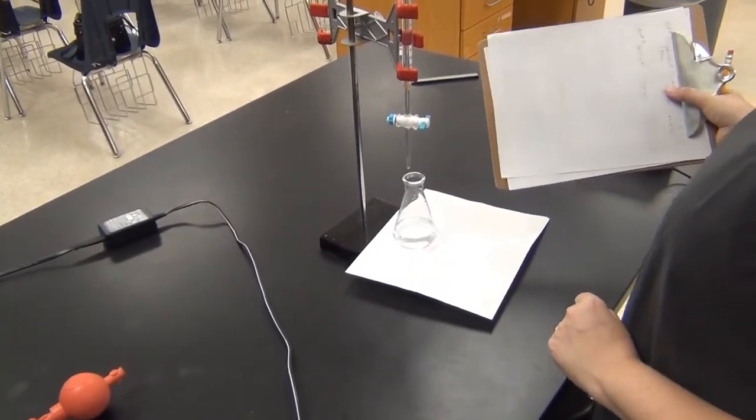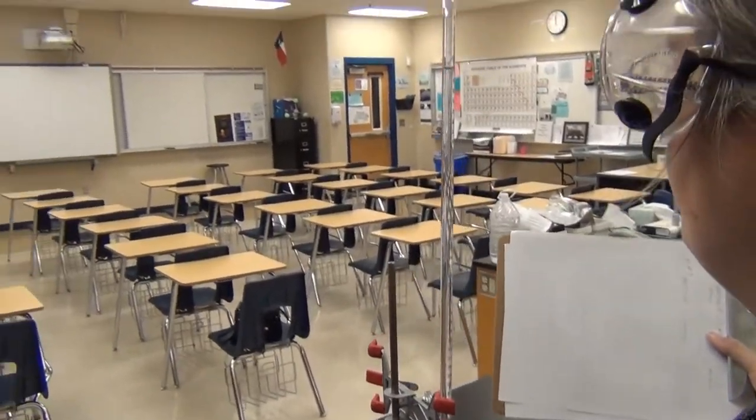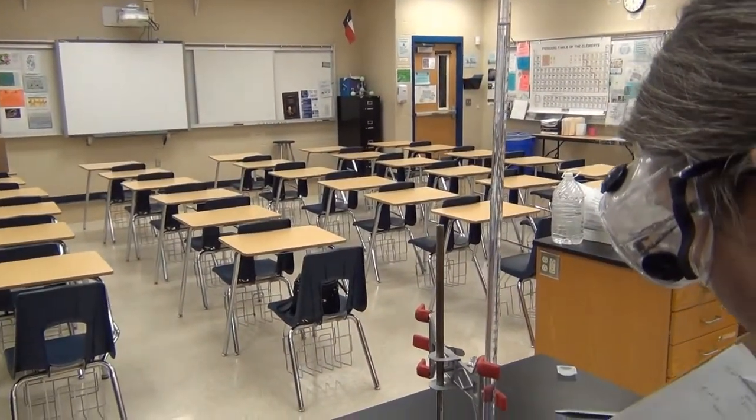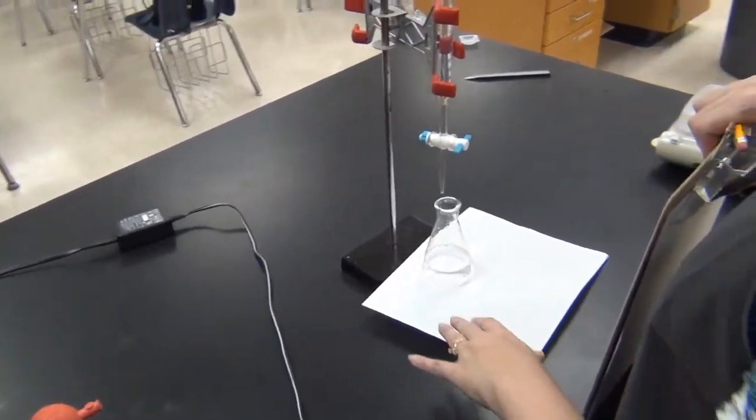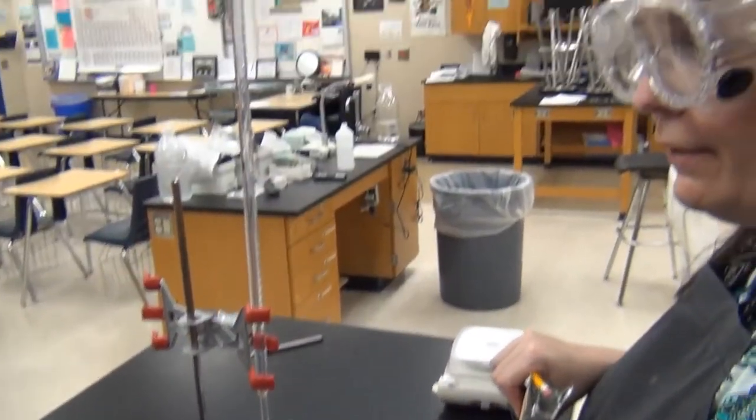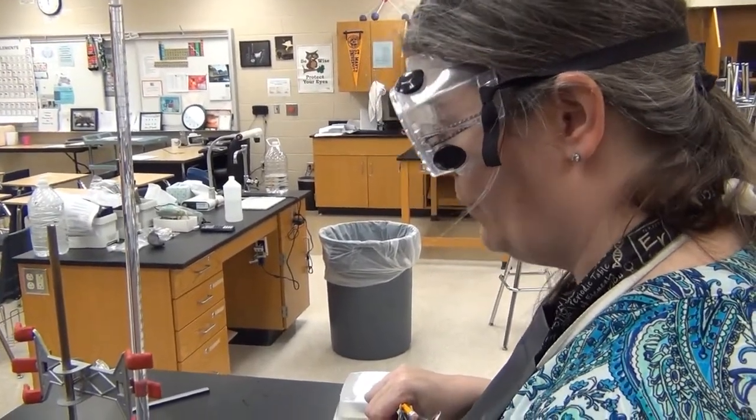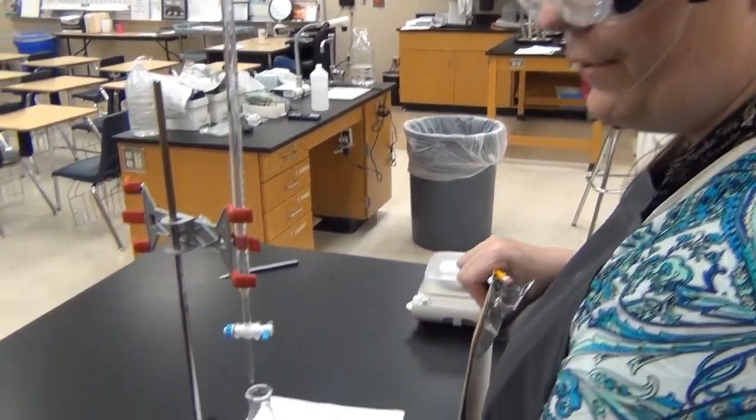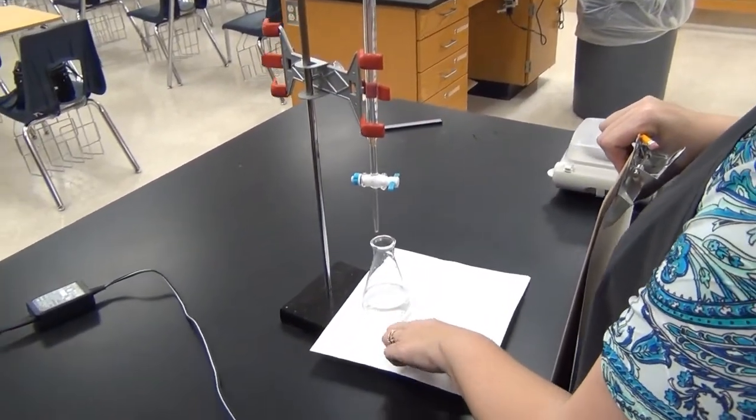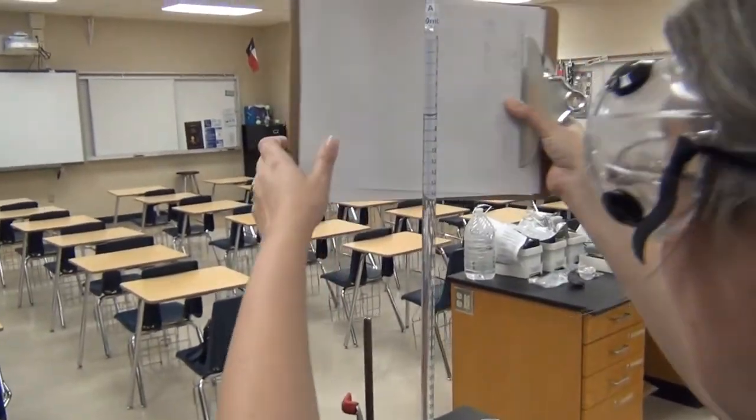We have our last unknown acid sample all queued up and ready to go. I've added the indicator, so we just need our starting volume of our titrant. For the analyte, we again put twenty five point zero zero milliliters of acid into the flask with a little bit of water and an indicator.